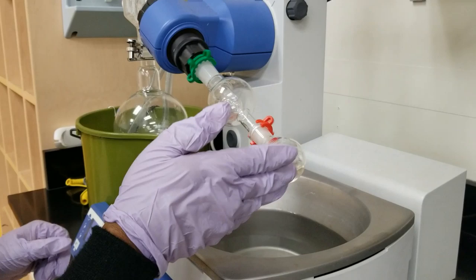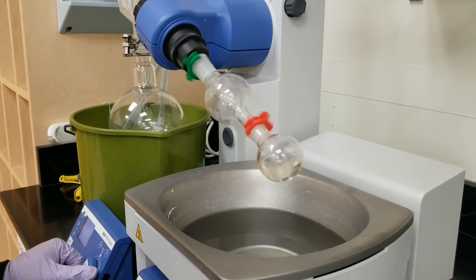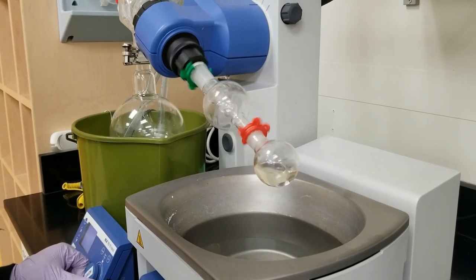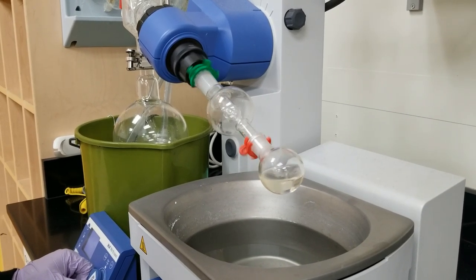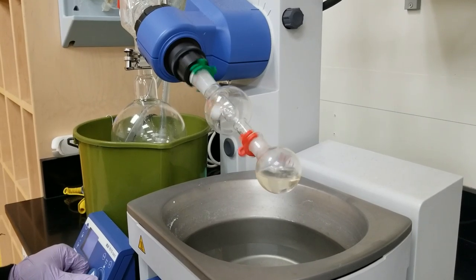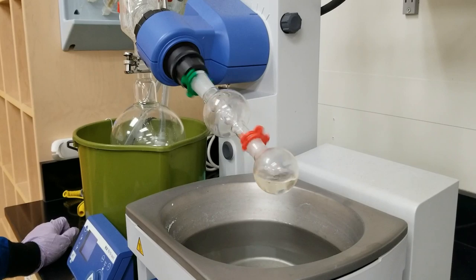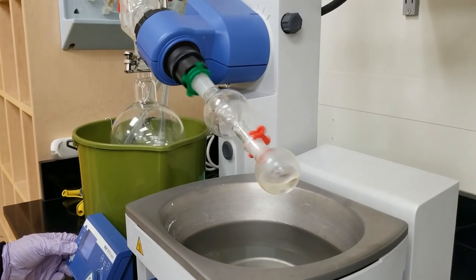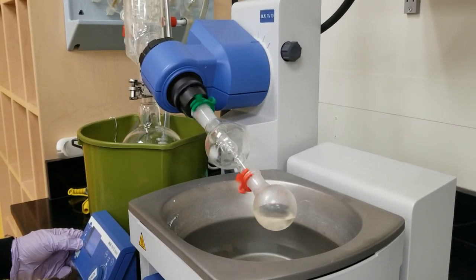So I have hooked the round bottom flask to the rotovap. The pump's on. We have turned the pump on, and the liquid is evaporating due to the suction of the pump. We can lower this a little bit. Lower the whole setup.